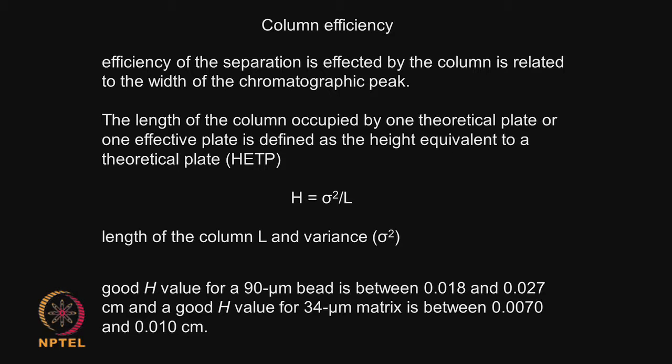Then we have something called column efficiency. Now, we come to the efficiency of separation. Okay. So far we looked at retention time and related things, but when we have many peaks, ideally I would like to have a good separation between two peaks. That is what I want. Ultimately, in chromatography I want to achieve that.